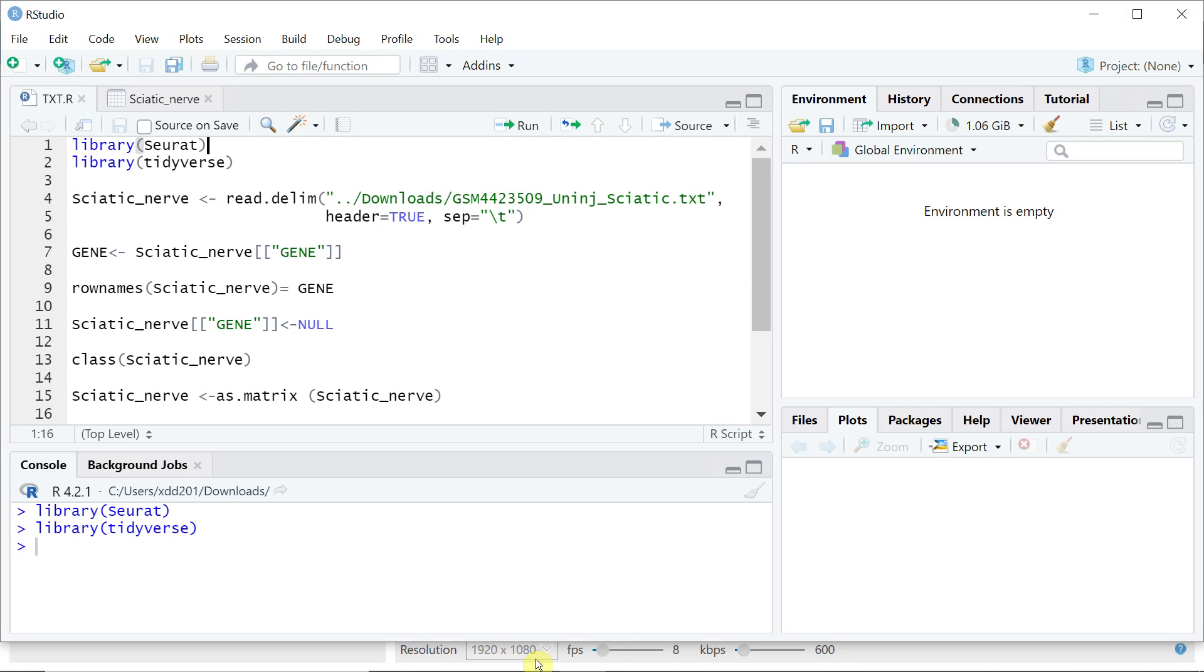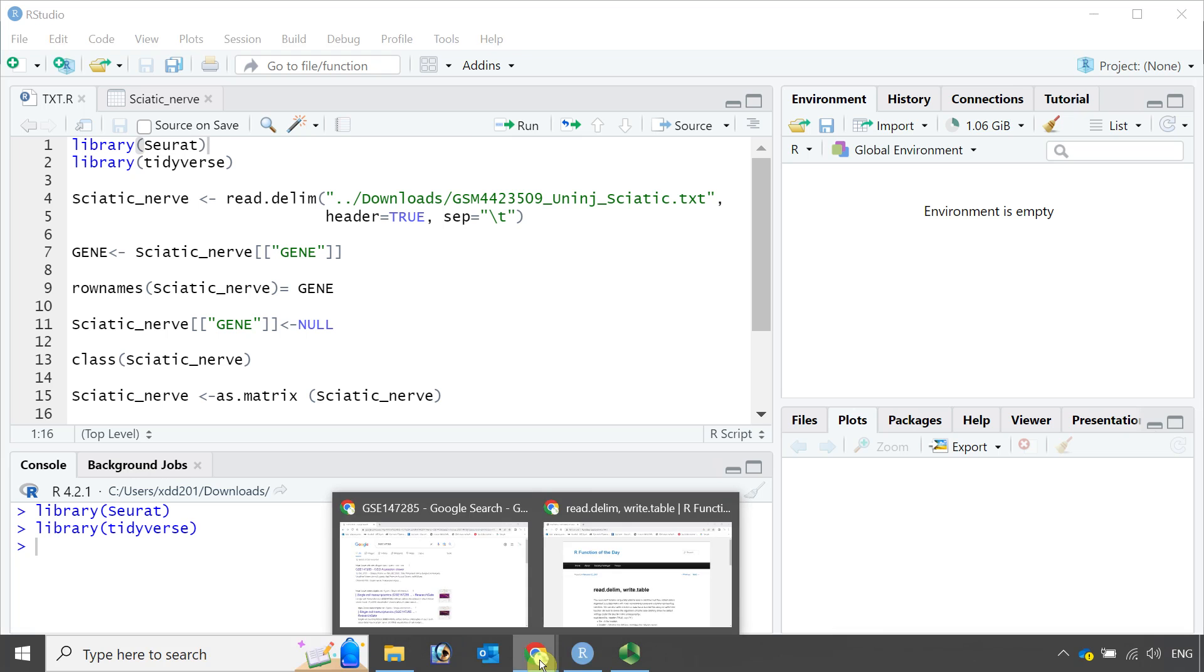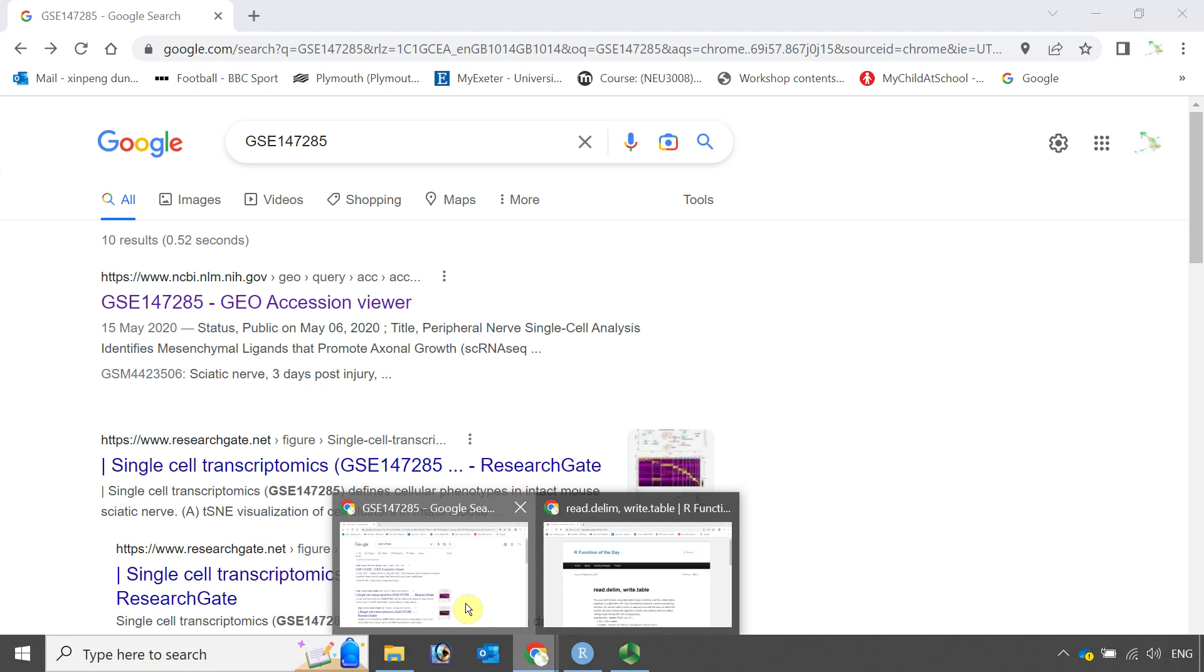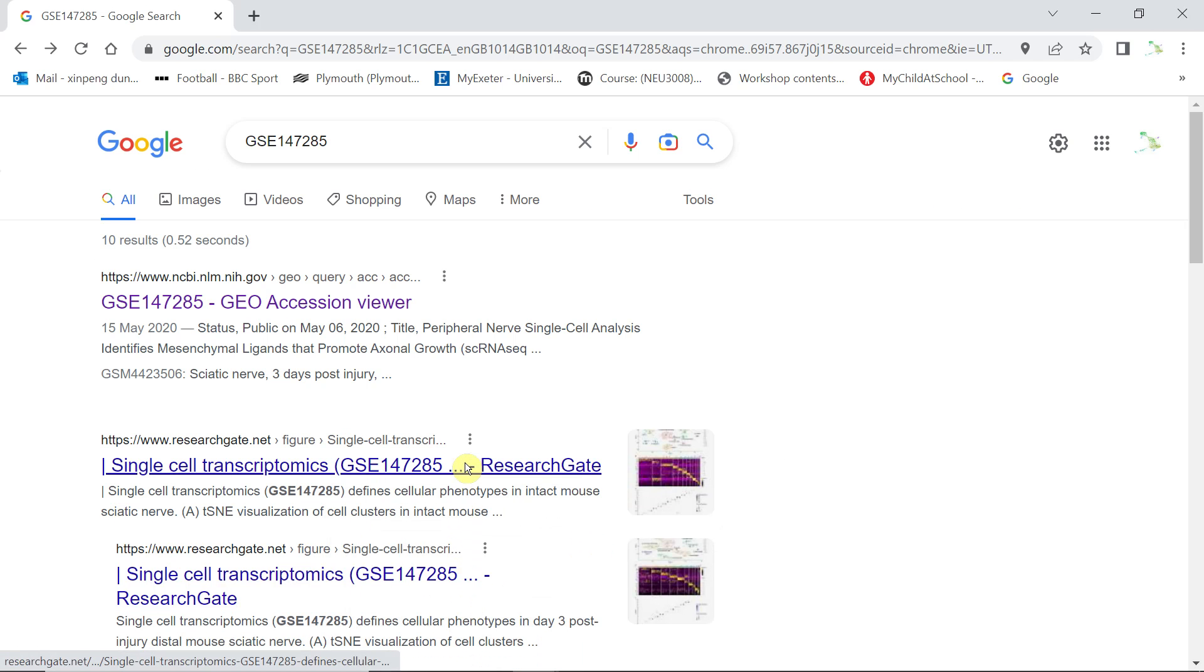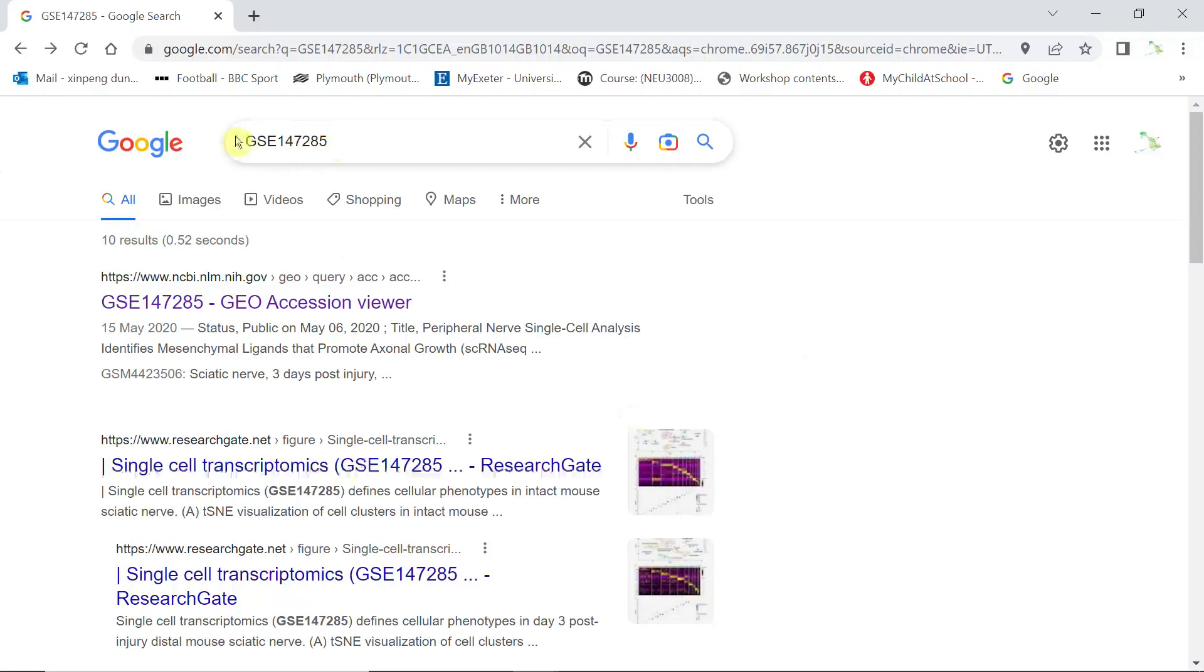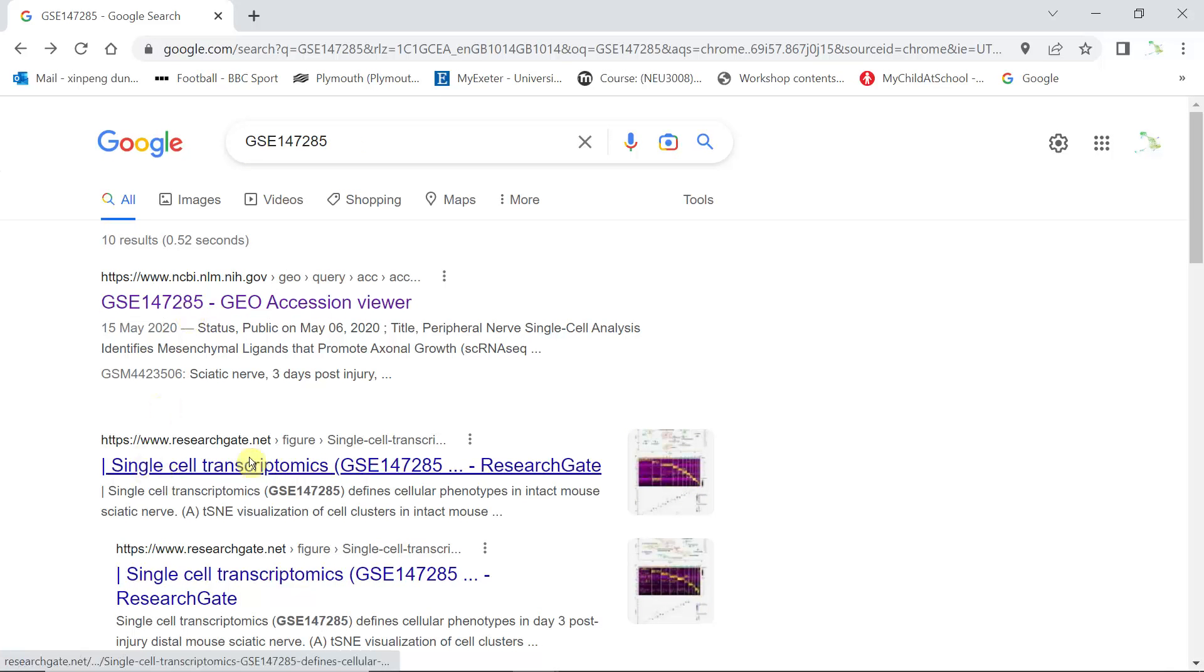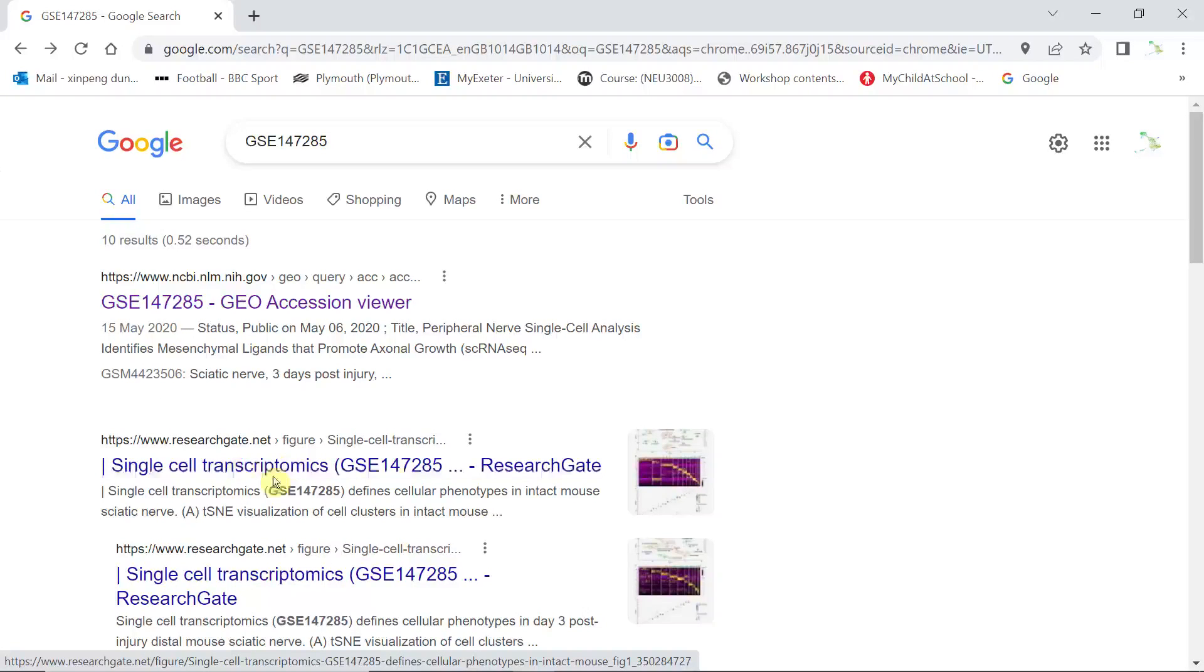The data I'm using for today's demonstration is GSE147285. If you search this dataset in Google, we can find this link, and also down here you can see we previously analyzed this dataset and published some research papers.